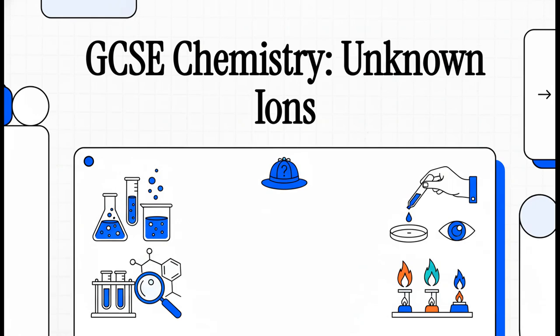All right, welcome back. In this explainer, we're going to put on our chemical detective hats. We're tackling one of the big ones from the AQA GCSE chemistry syllabus, how to identify unknown ionic compounds. This is AQA's required practical number 7, and trust me, it's about way more than just memorizing facts. It's about learning how to think like a real chemist.